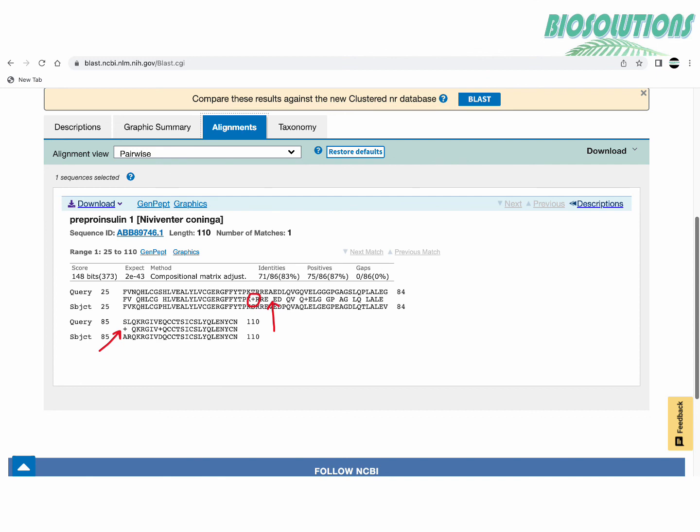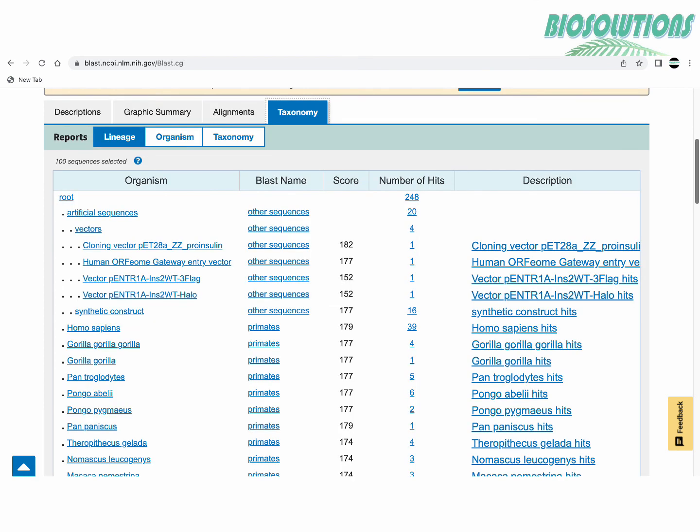Dashes in the sequence are gaps. The related information link on right hand side are links to other resources with additional information a user may want to see. Last tab is taxonomy. It gets us the classification details of the organism whose sequences have been chosen by BLAST for result display.